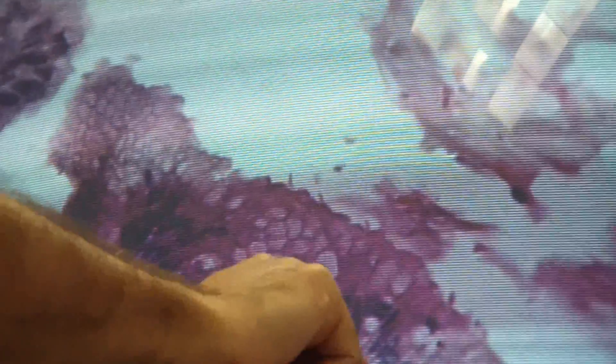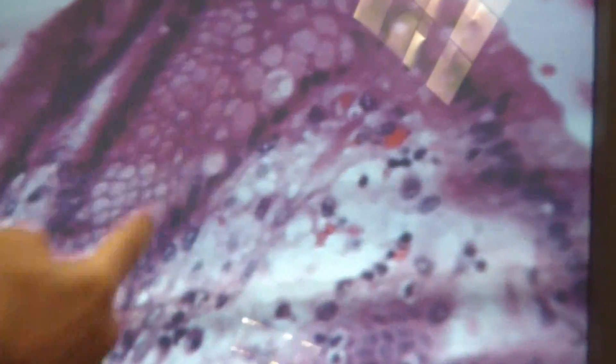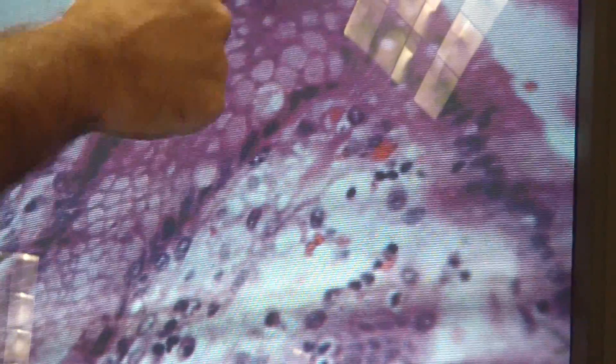See that? Because we said starting from the stomach we see simple columnar. So again, all of these are simple columnar cells and these are the gastric pits.